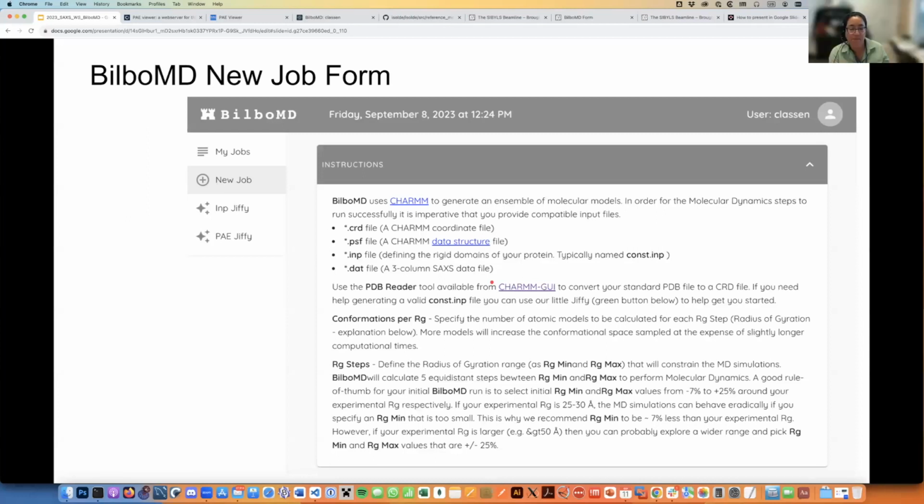Their code is not on GitHub. I cannot just go there and get it. It is possible we could write our own converter, but that's not a priority at the moment since someone has already done it. So it's a little bit of a detour that you need to make in order to use this, but it's really not too big of a speed bump, I hope. Okay, thank you.